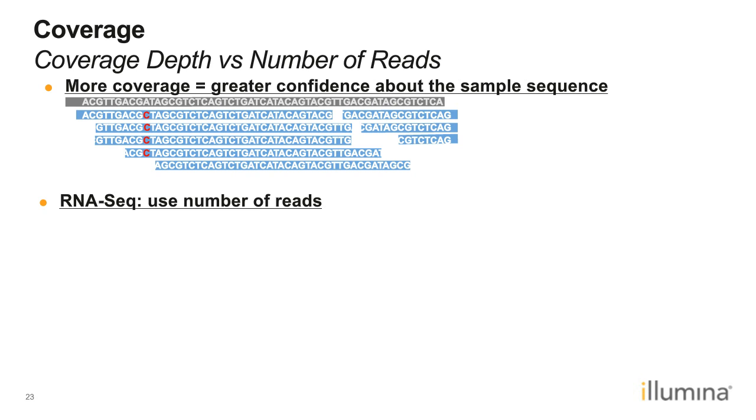When we're looking at differential expression, we can gain confidence if we increase our number of total reads. In this particular graph, each dot represents the expression of one gene. The X and Y axes are 2 replicates. Now, we would expect there to be a solid line across the XY axis.